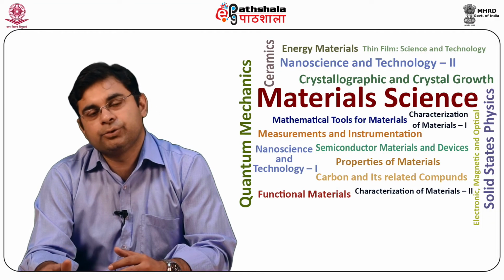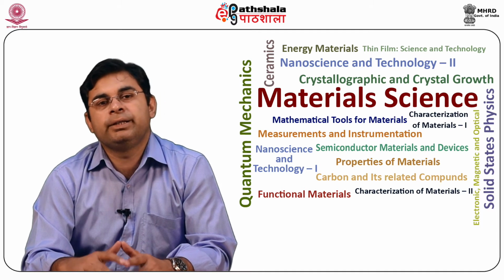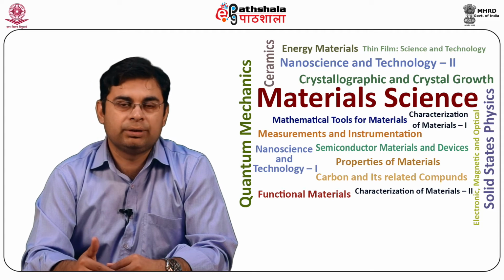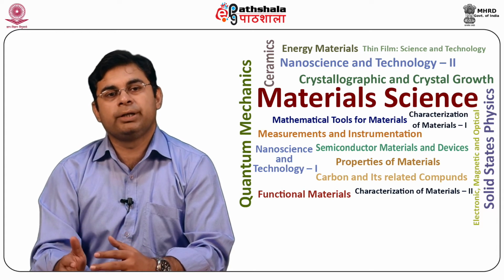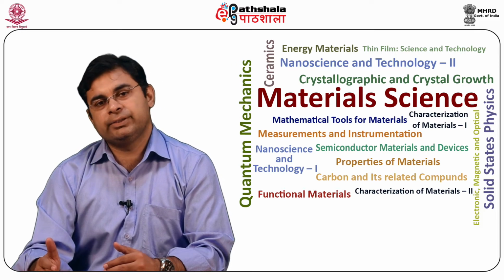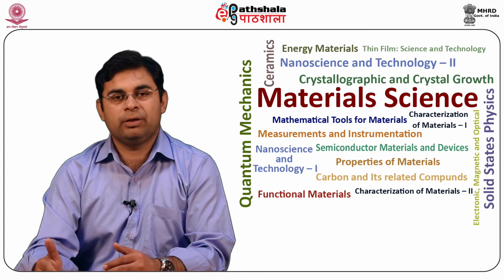Scanning tunneling microscope. The scanning tunneling microscope was developed in the early 1980s at the IBM Research Laboratory in Switzerland. The microscope was developed by Binnig and Rohrer, for which they were awarded the Nobel Prize in Physics in 1986. STM consists of a small, sharp conductive tip that scans across the sample of interest.